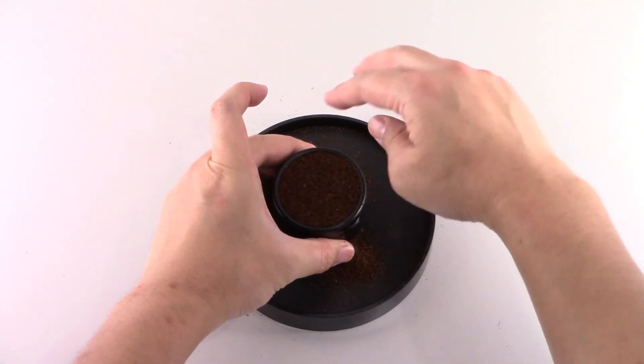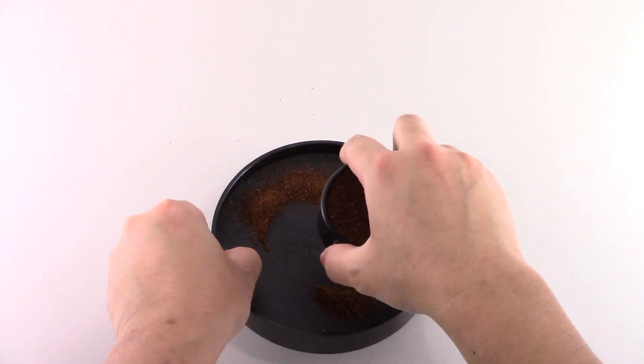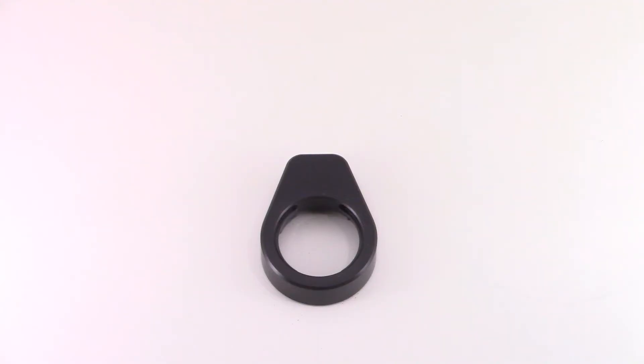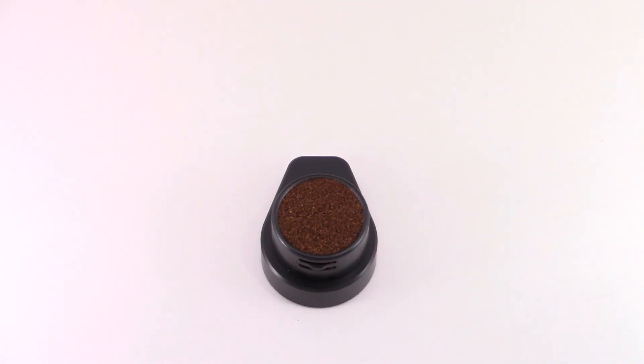Dust off leftover grounds and make sure the surface is evenly flat. Place the sample cup on the base with the latch forward, then cover with the analyzer unit.